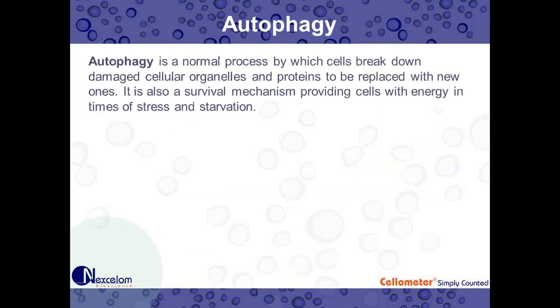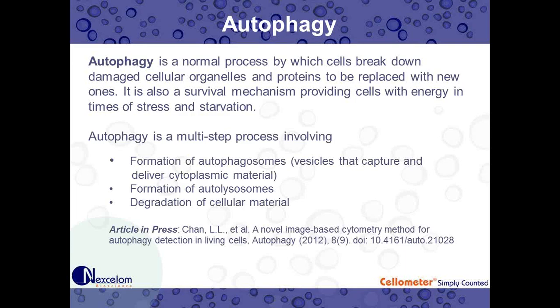Autophagy is a cell-based assay that's really hot right now. We have a lot of customers asking about this when they come to our booth at trade shows. Autophagy is a normal process by which cells break down damaged cellular organelles and proteins to be replaced with new ones. And it's also a survival mechanism providing cells with energy in times of stress and starvation. It's a multi-step process that involves first the formation of autophagosomes, which are vesicles that capture and deliver the cytoplasmic material to be degraded. Formation of autolysosomes, where lysosomes fuse with the autophagosomes, and then the degradation of the cellular material.